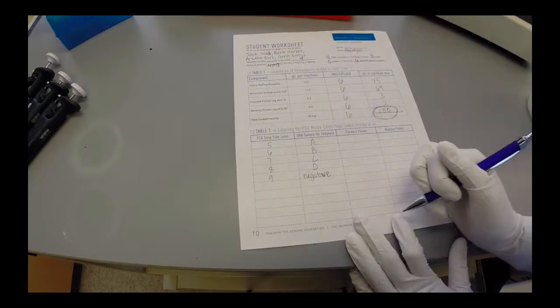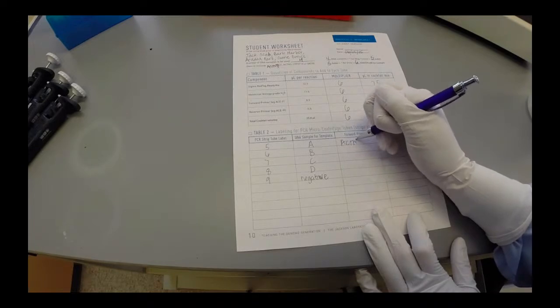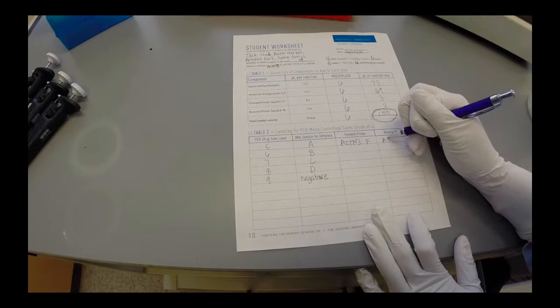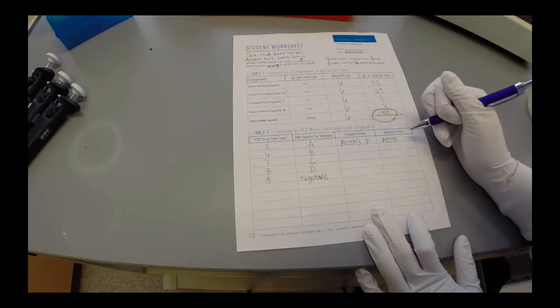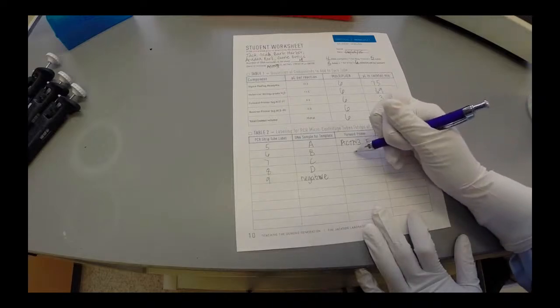In this example, the forward primer is actinin 3F, and the reverse primer is actinin 3R. The same primers are used for all samples.